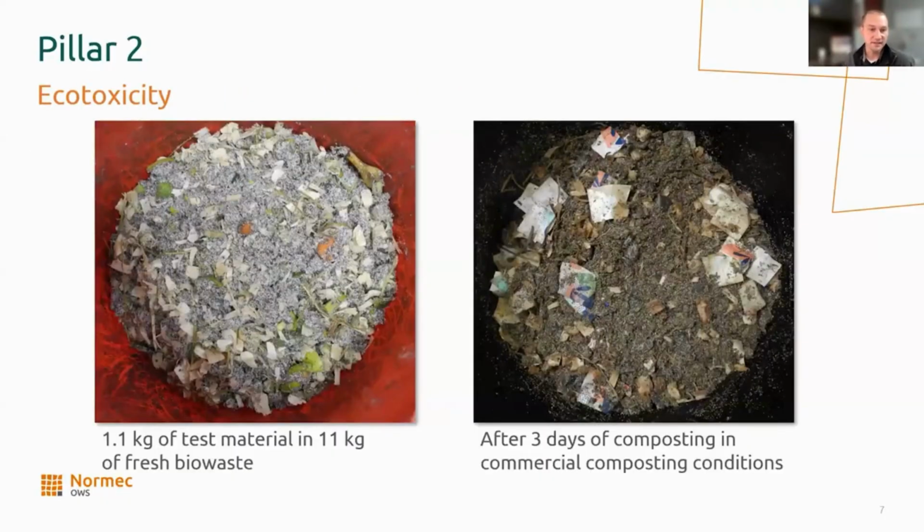Visually, this is what a 10% input concentration looks like. So the picture on the left here shows 1.1 kilograms of test material added into 11 kilograms of fresh bio-waste. And you can see from this picture, this is well exceeding a typical concentration of material that would exist in a real commercial composting facility. And the point that I'm trying to make in all of this is that the laboratory testing stringency is much greater than those conditions that actually exist in real-world commercial composting facilities.